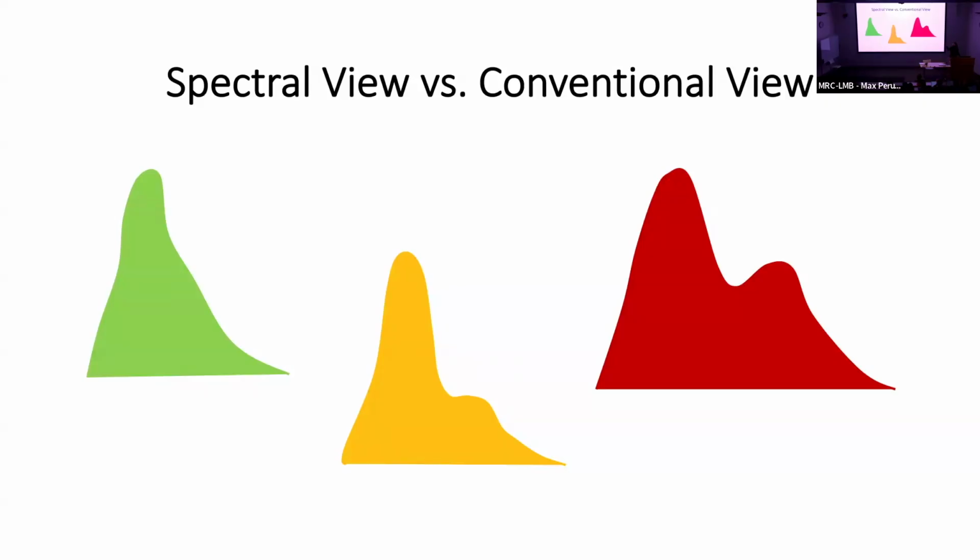But the advantage here in spectral is that you have the ability to use two fluorophores that are very similar in their overlapping emission profiles, which you would never be able to use in a conventional cytometer because they would be directly overlapping, and it's not taking into consideration any subtle differences in their spectral profiles.